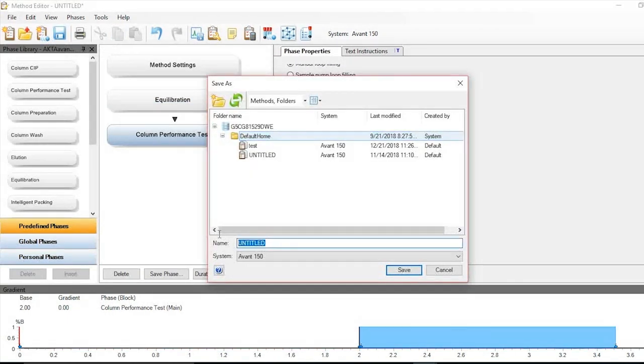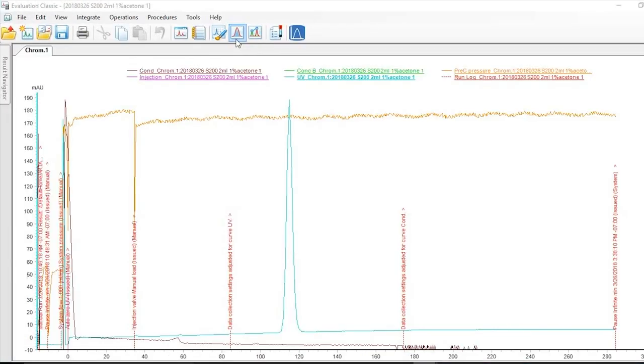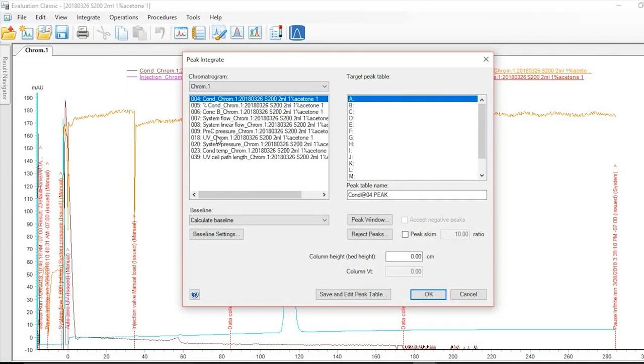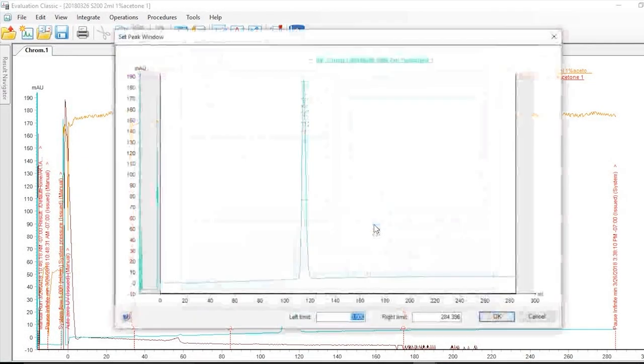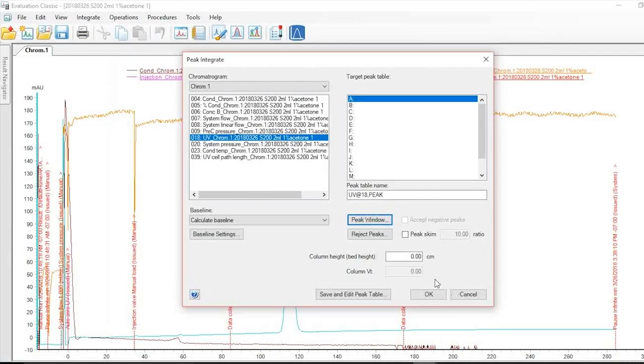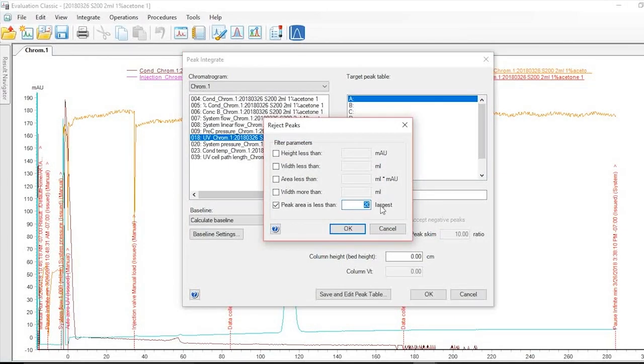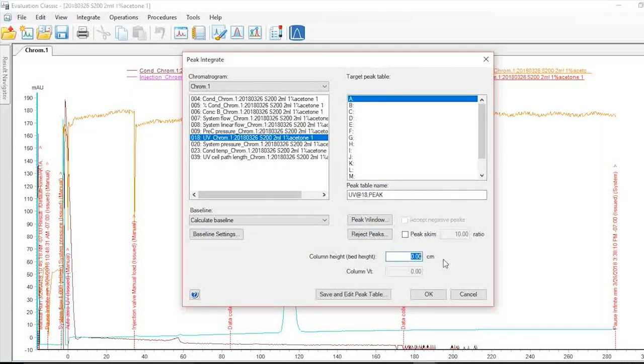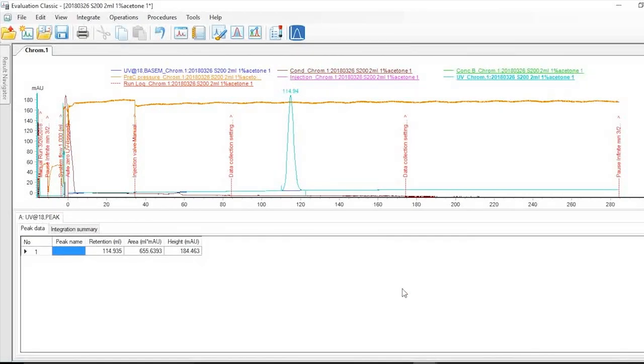Apply the sample and start the method. When this run ends, open the result and integrate the UV signal. Type in the bed height of the packed column. Click right in the data table, select HETP and asymmetry. Here, you can find the relevant values of column performance in the data table.